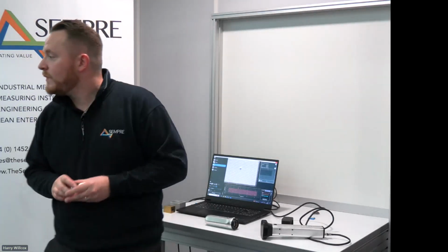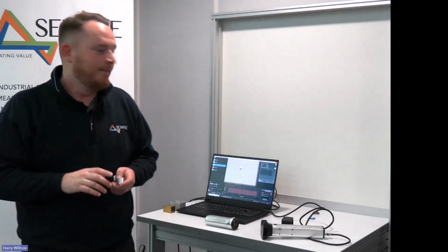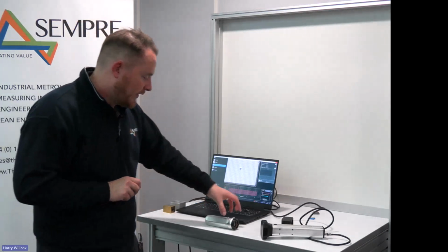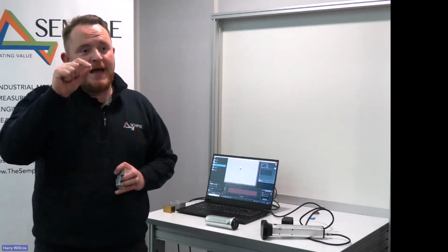Okay. And the last one, what is the maximum range in the Z-axis? It's a slightly subjective answer, as it depends which system you're using. The focus range on a Gelsight Max is 250 microns. So that's the limitation as to the depth that we'd be trying to measure. On the Gelsight Series 2, we have about 2.5 millimeters of pad depth.